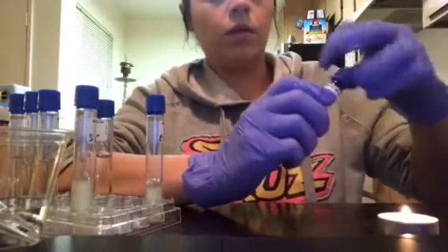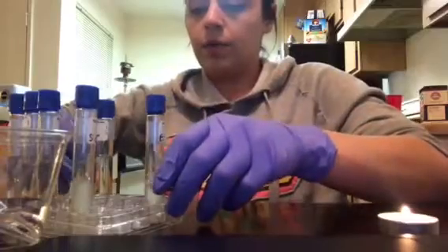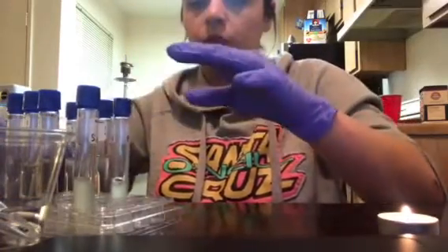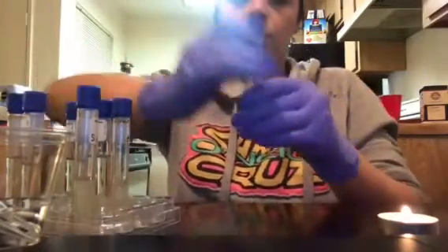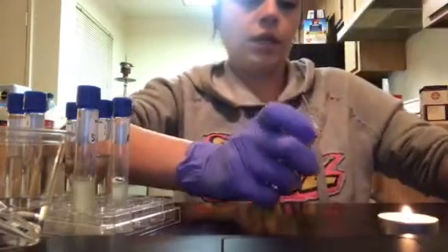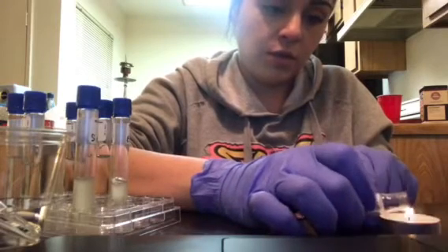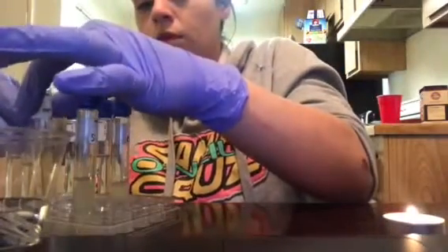Okay, so now that the cerevisiae is done, I'm going to now do the same thing but for the epidermidis. So to save time, I'm just going to flame the tips first. I was kind of thinking I would just do it one at a time, but I think it'd be faster just to do them all at the same time. So I'm going to flame these lips to sterilize and set them down.